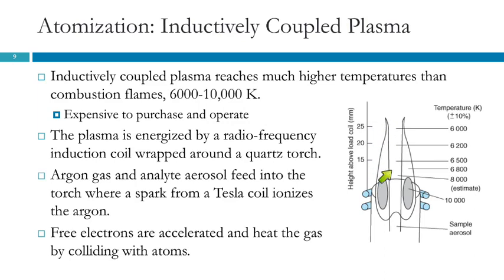And this shows you there's differences in temperature as you go from right down here inside the coil up above. And so the temperature that you are looking at will vary depending on how high above the coil.